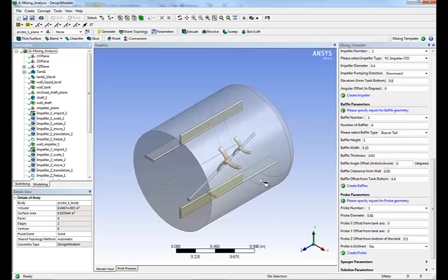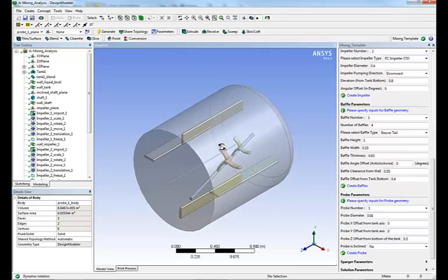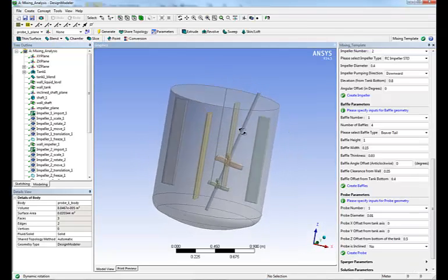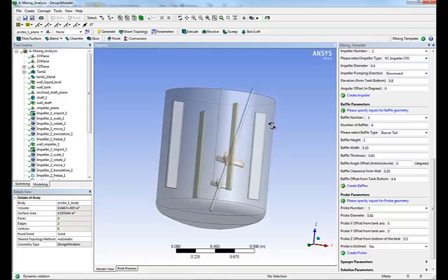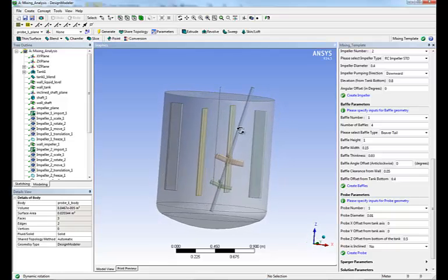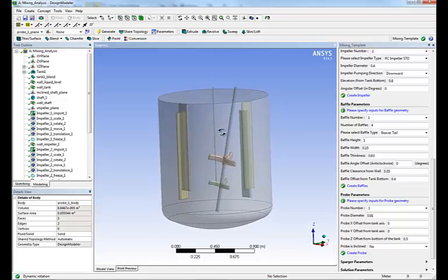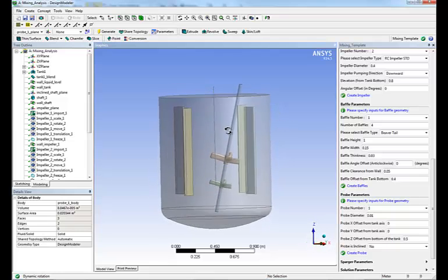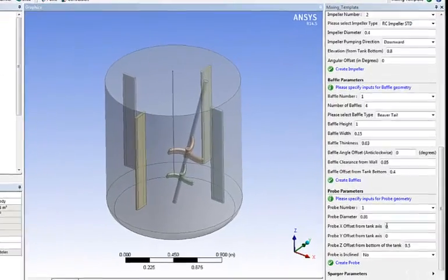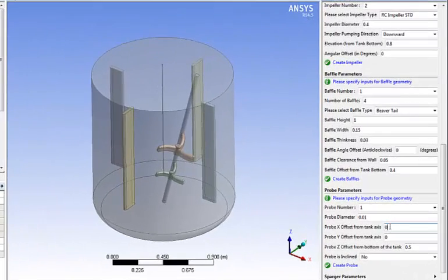Next we set up the probe. Same ideas. Enter the dimension and the location. Click create probe. We're actually going to inspect our geometry. And I'm just realizing that I didn't place the baffle at the right position.